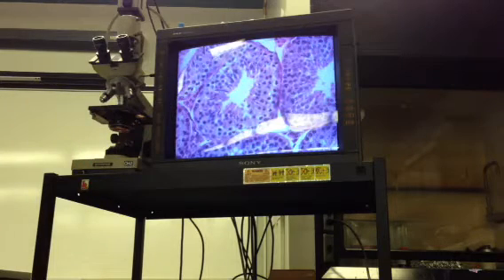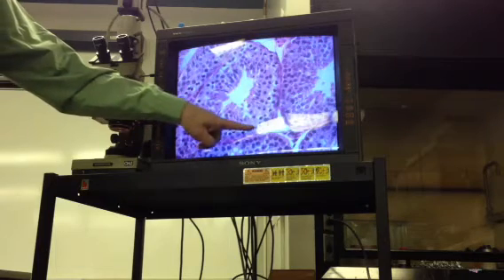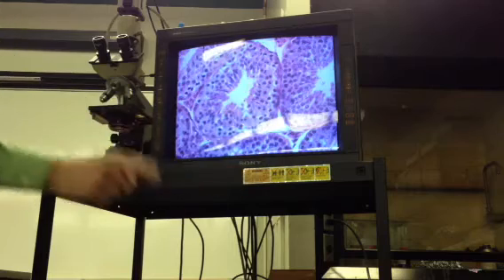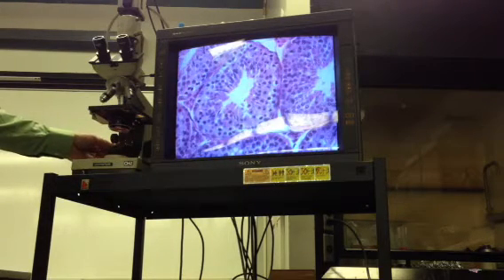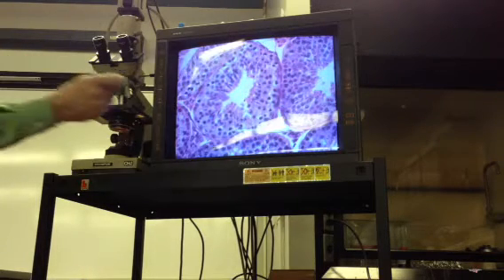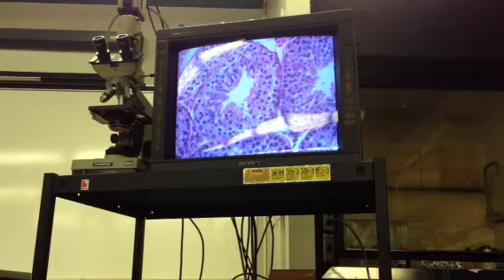And now around the periphery here, these very darkly stained cells are spermatogonia. The cells that you will see tend to be toward the periphery. Look at this one in particular. You see this? Get a pencil out.